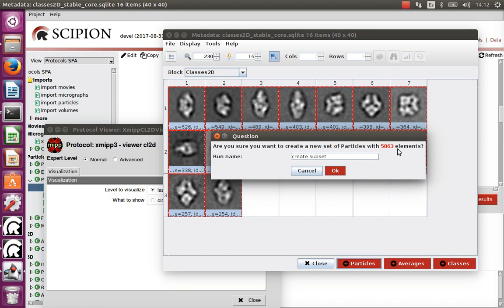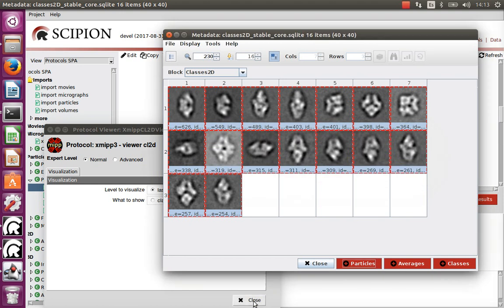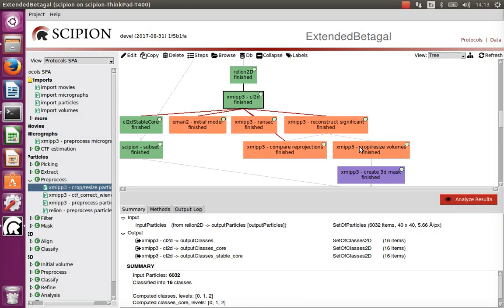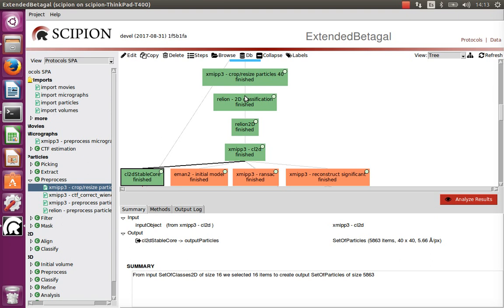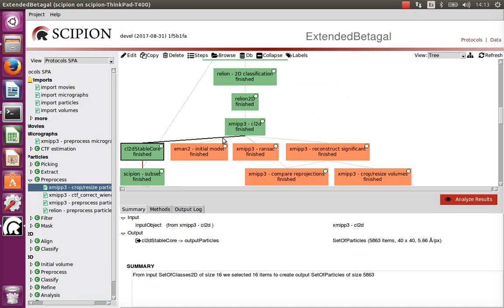We analyze the stable core, take all images from all classes, and generate particles. The images not belonging to the stable core number only 140 — a reasonable price to pay to ensure the remaining images are good enough. So we use RELION 2D to get rid of bad particles, then classify those 10 RELION classes into more detailed classes with CL2D, and the stable core of CL2D allows us to reject further bad particles.